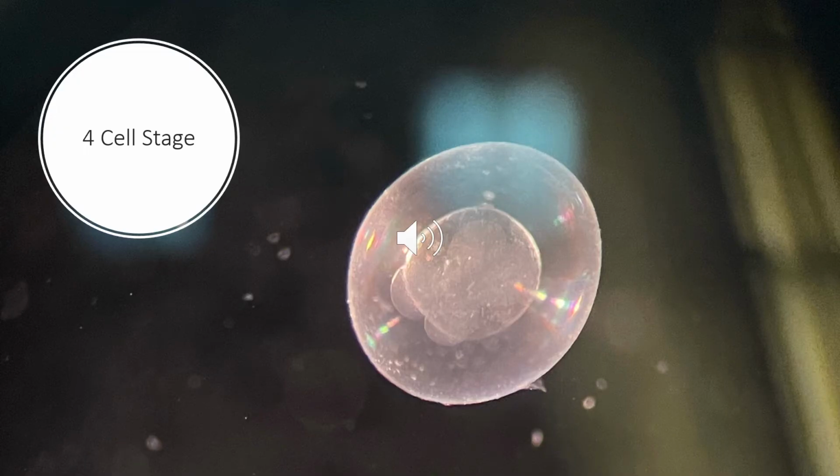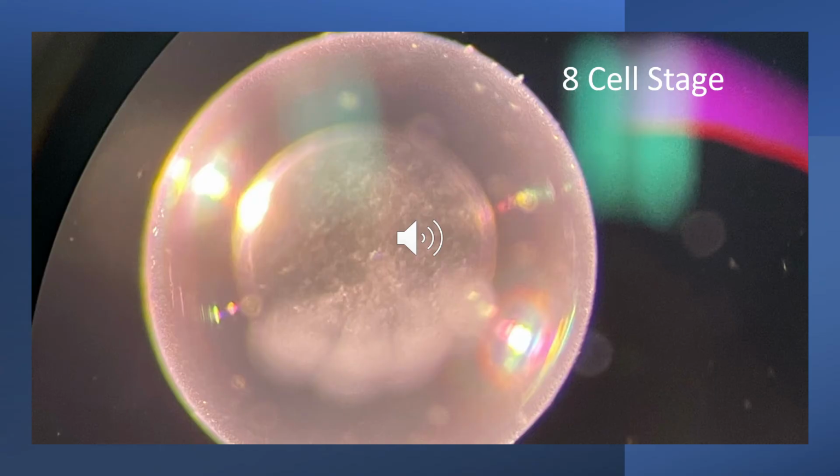Next up is the 4-cell stage. This is approximately 1 hour after fertilization. This stage occurs within minutes of the 2-cell stage, showing just how fast the development of the zebrafish occurs. Ensuing development continues from the 4-cell to the 8-cell stage. This stage is typically observed about an hour and a half post-fertilization. Again, as in the 2 and 4-cell stage, the cells can clearly be observed at the animal pole.